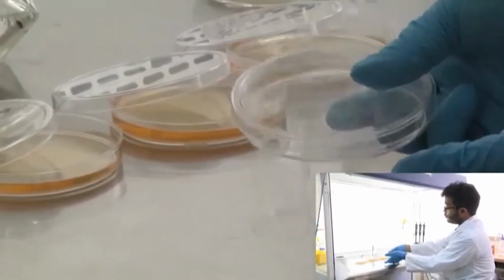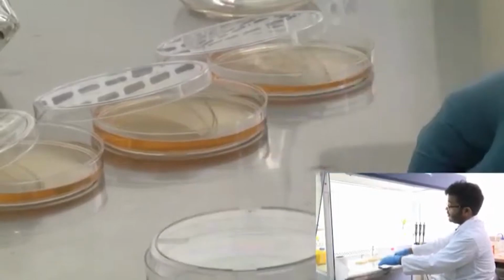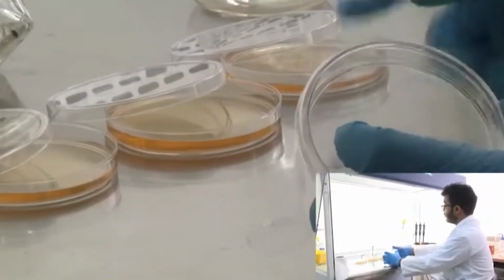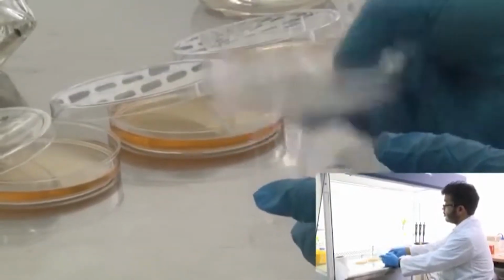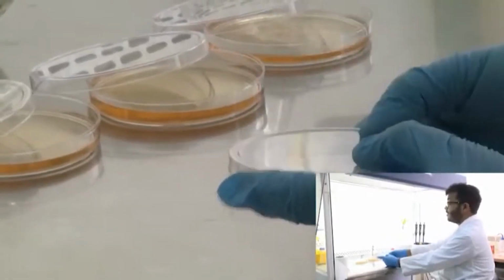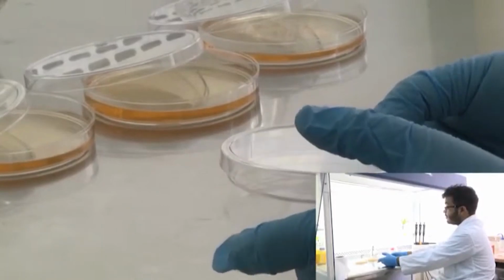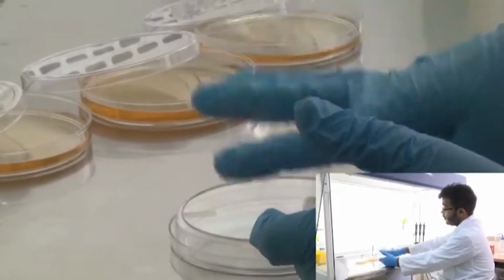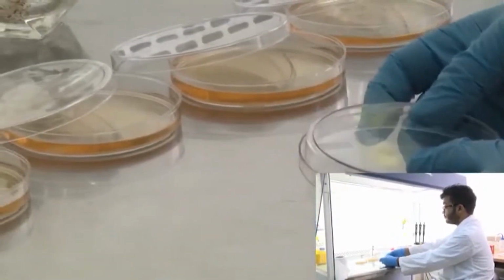But when we are going to store this in the fridge or elsewhere, you have to keep it upside down, because otherwise condensation which develops on the top of the lid, you can already see some, because it is hot, there is some condensation, right. If you leave it like this, the water droplets will drip off and fall onto the LB agar bed, and that is not good lab practice. To avoid that, you have to keep it like this when you are storing it, or even after plating when you are keeping it.